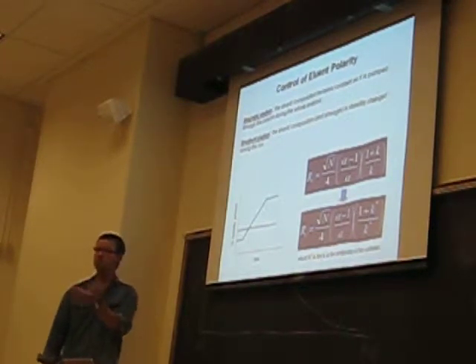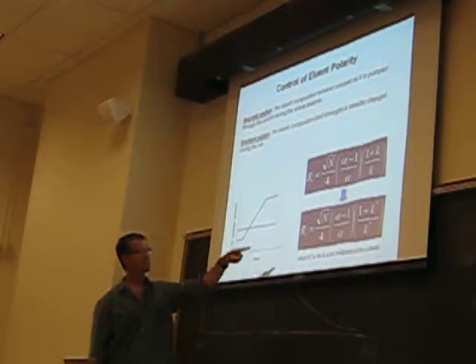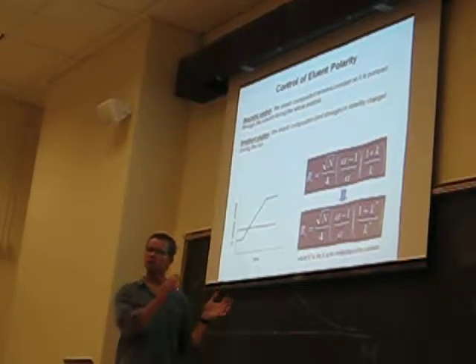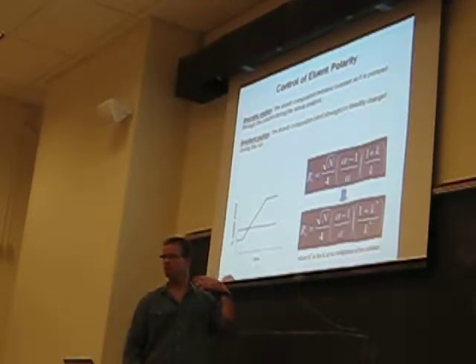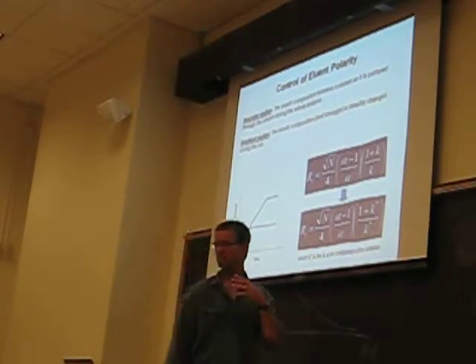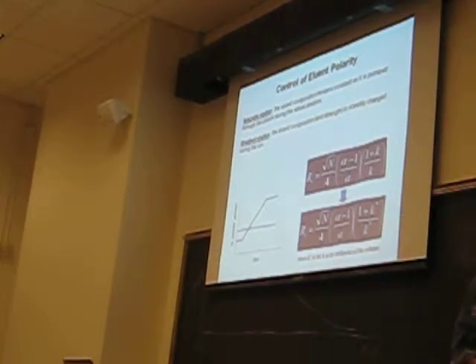And so for you, you'd say, for the separation of these anions in my unknown samples with my method, I can calculate a resolution for each of those peaks, for each of those anions. And somebody else could come on and say, oh, I have a new and improved anion exchange column, and I think it's going to actually provide greater separation for some peaks. And they would go ahead and have their method with their mobile phase, and they can calculate the resolution for each of the anions in that method. And compare and say which will provide better resolution.